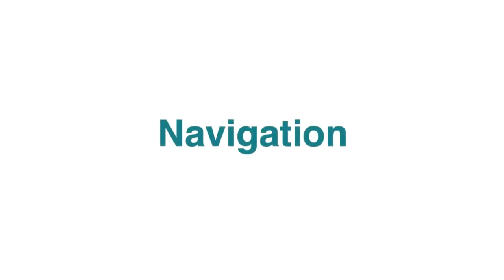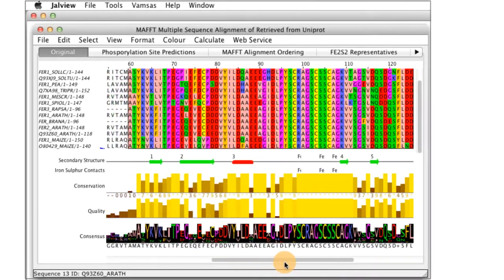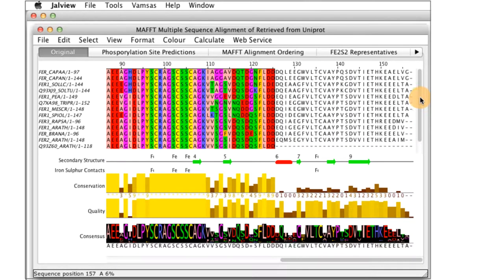Let us now check out moving around the desktop. You can use the rulers at the bottom and at the side to change the location of the sequences you are viewing.